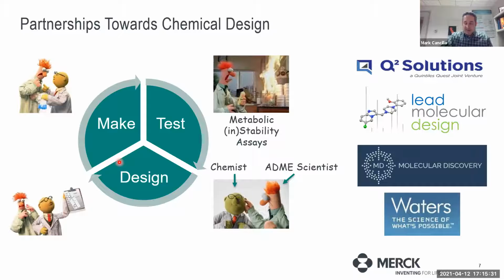And I'm sure, again, many of you have had to deal with this. You can't just do this alone, even within an organization such as Merck, and even with their resources. You really need to go outside and sometimes work with outside partners. So I'm going to be discussing a collaboration we put together to build this assay with the CRO, Q2 Solutions, as well as software solutions from Lead Molecular Design and Molecular Discoveries, and in some of the cases, Waters and Thermo and other instrument vendors.